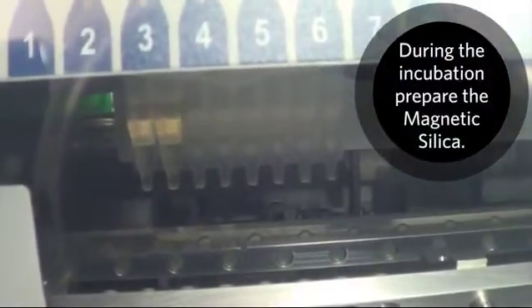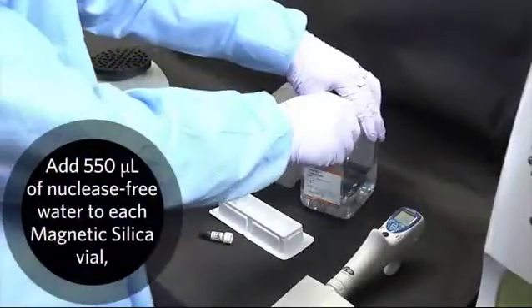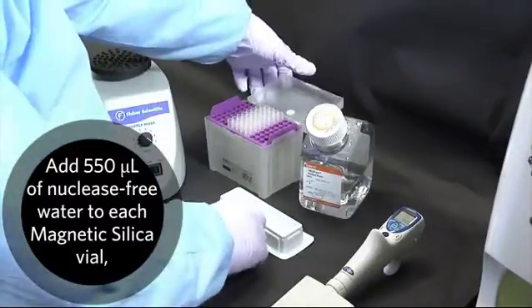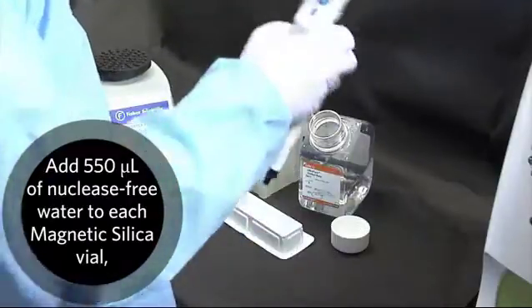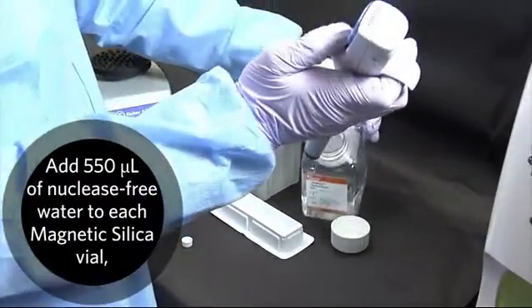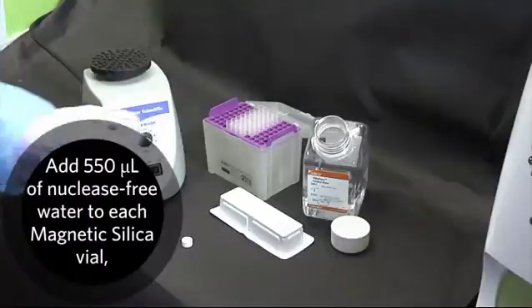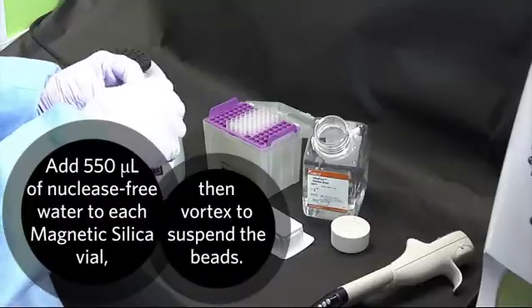During the incubation, prepare the magnetic silica. Add 550 microliters of nuclease-free water to each magnetic silica vial. Then vortex to suspend the beads.